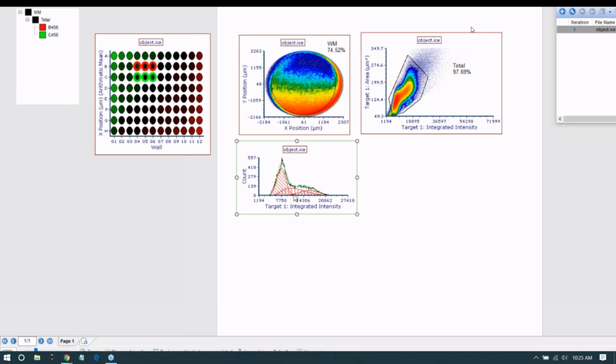So now the histogram is focused on just the plot area that has the data, but it's not looking too pretty. So this is where we want to use the graph right above us here, the object X and Y positioning, to see if we can improve it.